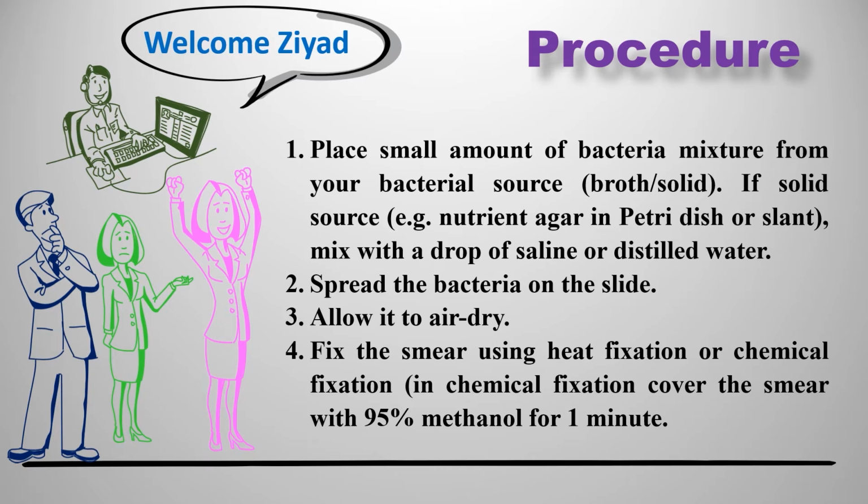After you finish preparation of your slide, you are now ready for staining your bacterial slide and visualizing it under the microscope. This is all for today, but we have a question. We will answer it in the second slide.